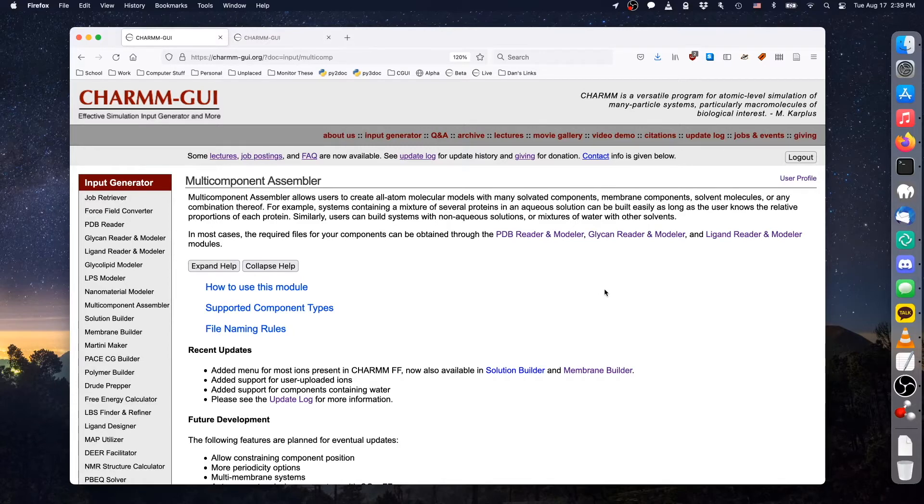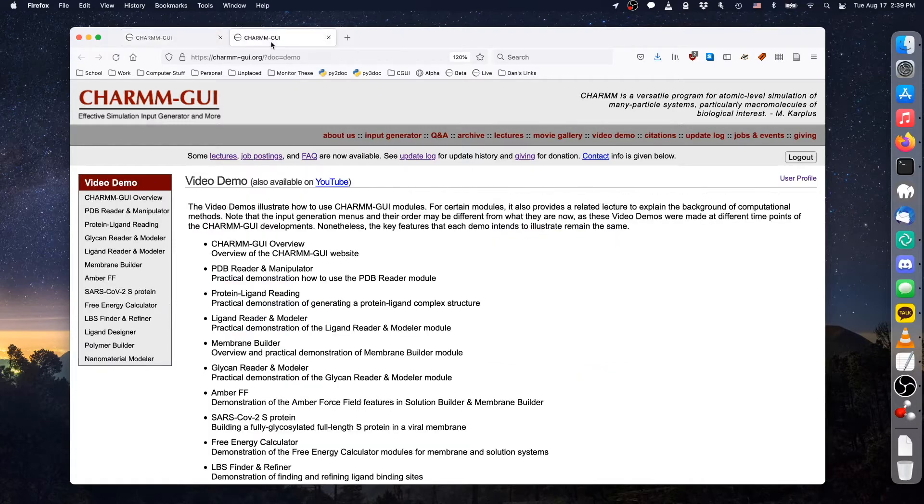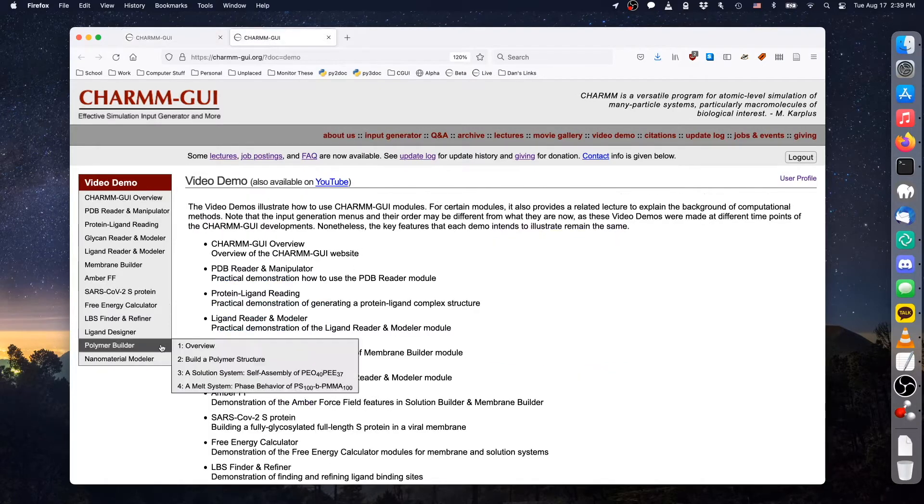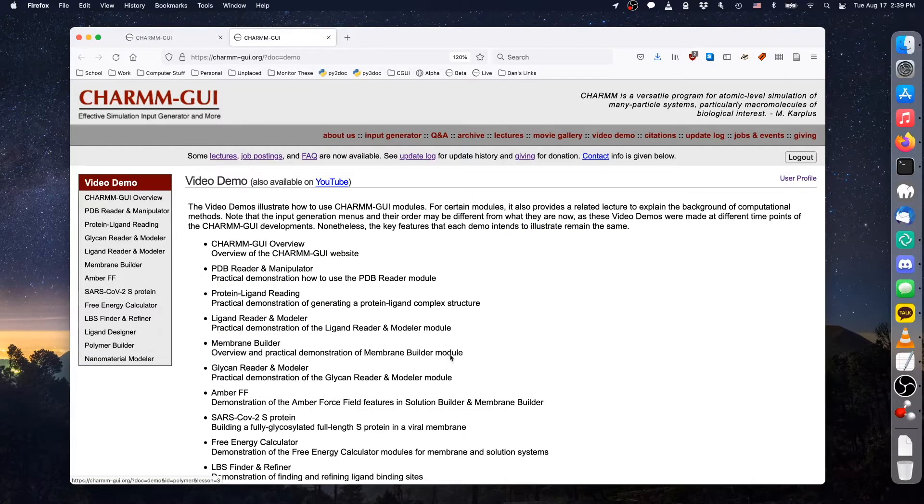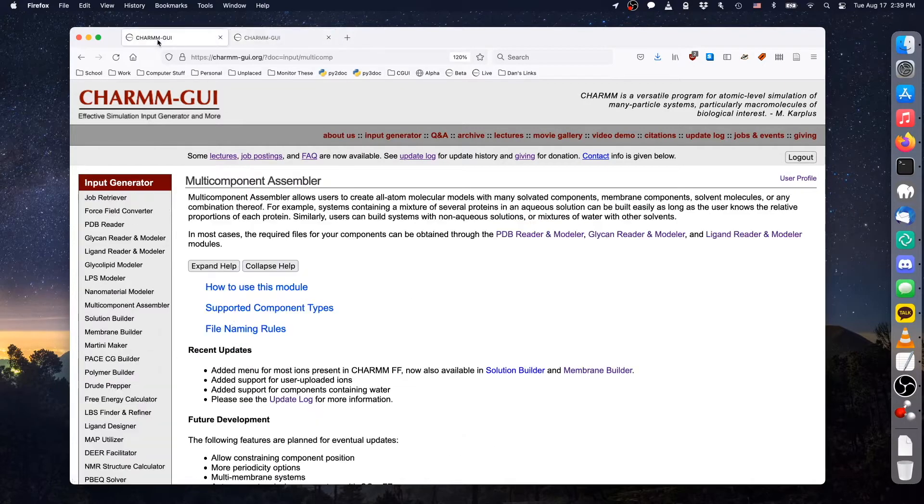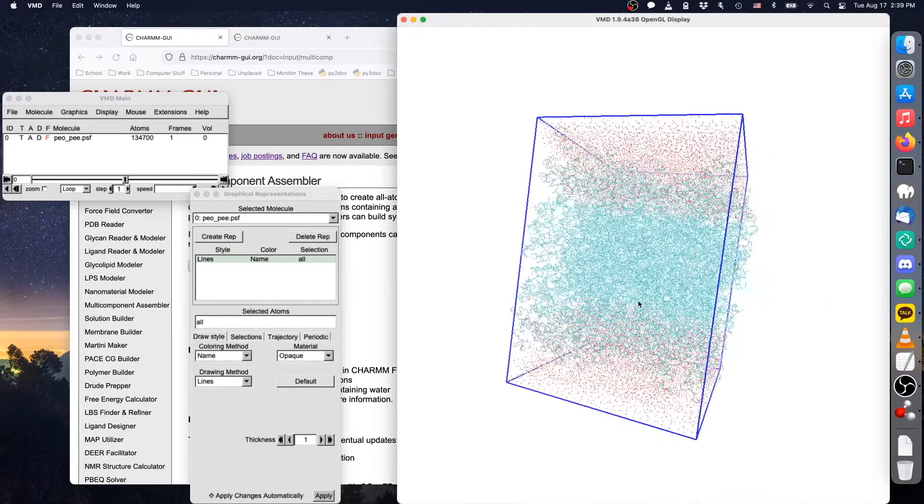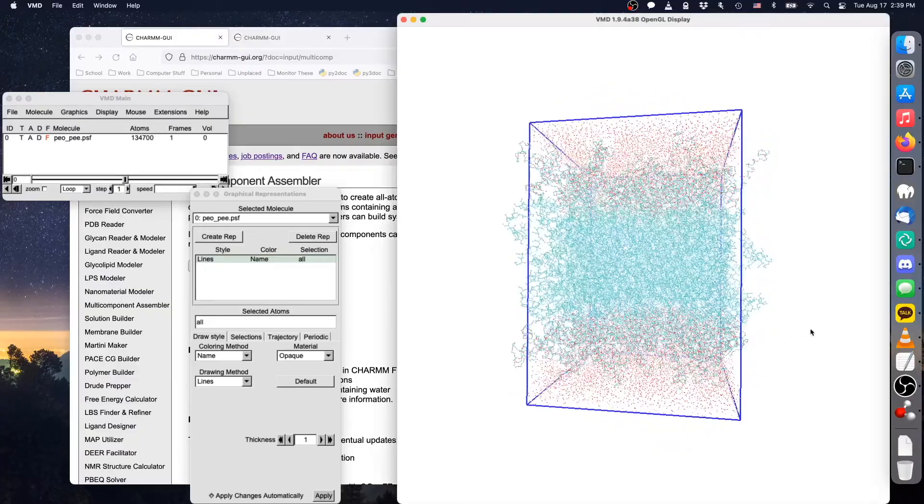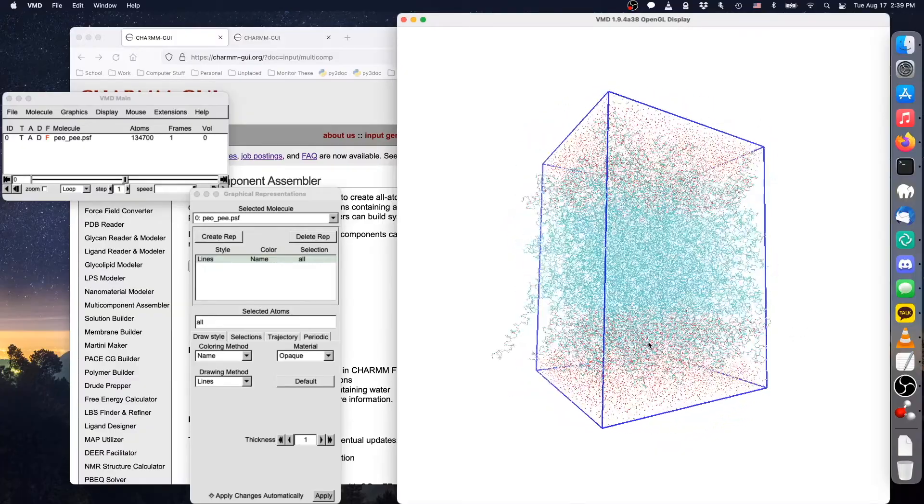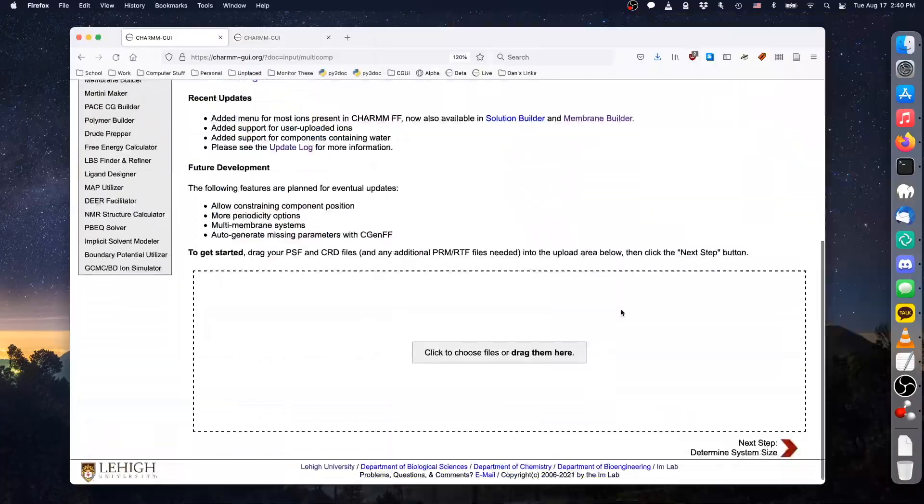We will start with a membrane-like polymer. The polymer that we will use is polyethylene oxide, polyethylene ethylene. This is the same material produced in the third video demo for Polymer Builder, and you can watch that demo to see how we made it. For this demo, we will use a pre-built polymer that you can download in the video description below.